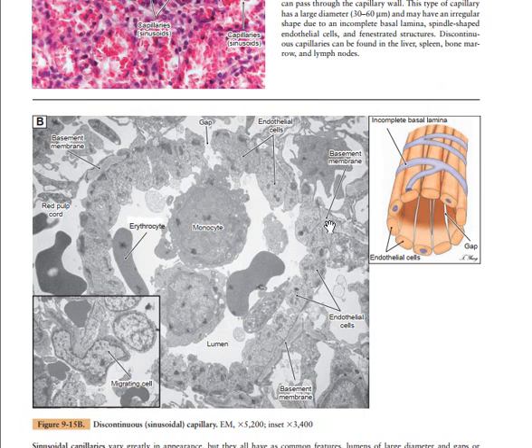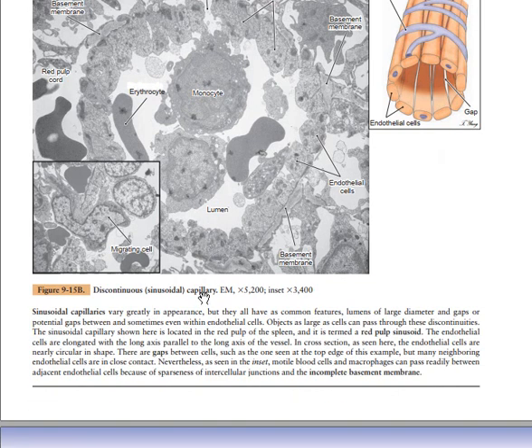Close to it you can see some macrophage cells. This one can be considered a macrophage, another one here a macrophage, and those macrophages are going to engulf. And this is another monocyte, a macrophage. These are the erythrocytes here. So the macrophages are going to enter into the capillaries, and then they are going to engulf the malformed red blood cells and the old red blood cells.